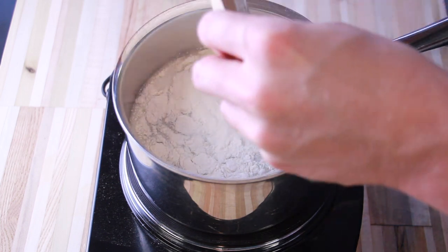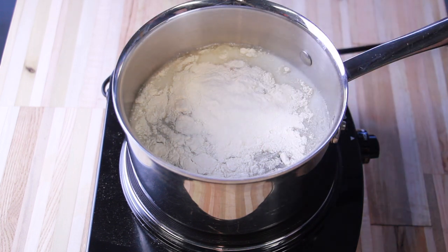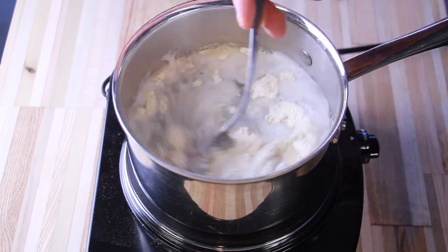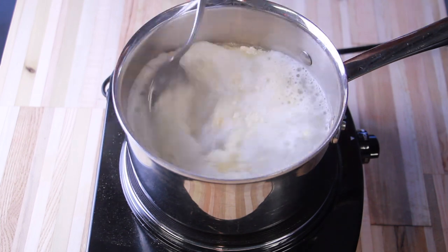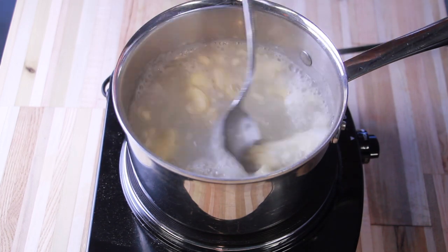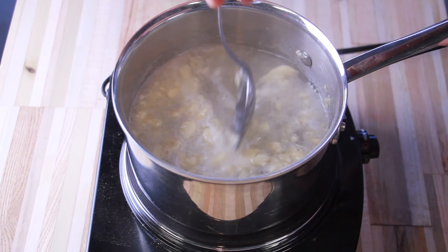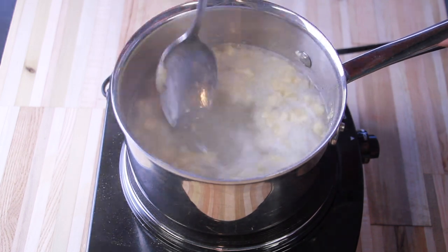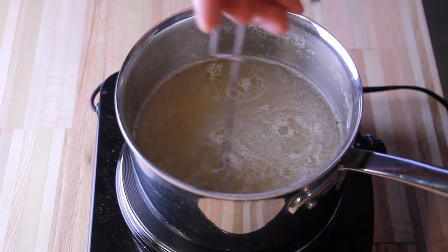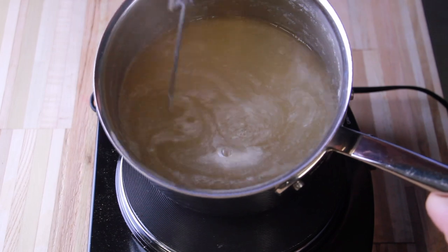Pour the agar powder into my almost boiling water. Started giving it a mix and realized that pouring it into hot water just turned it all into giant clumps. So I spent the next like 30 minutes trying to get all these clumps out, and it was kind of a pain in the butt. So I suspect that if I had mixed it when it was cool, it would have mixed a lot easier.